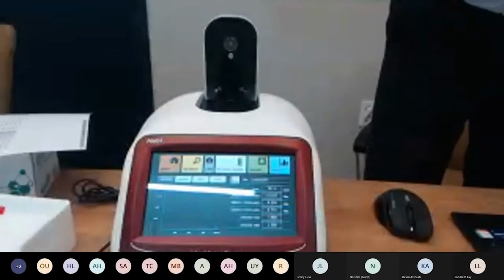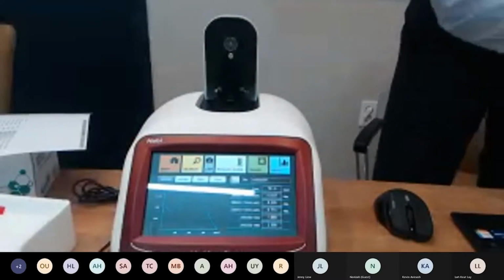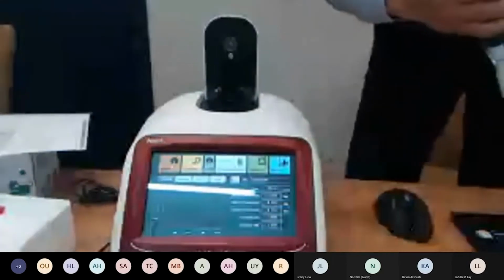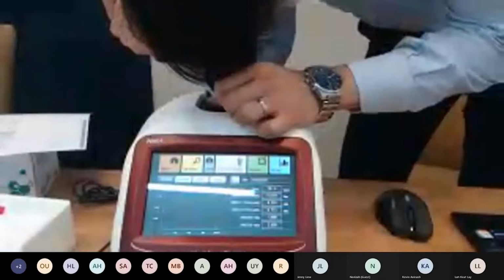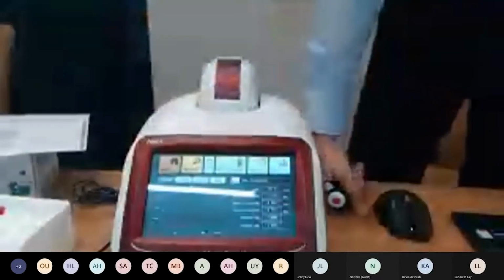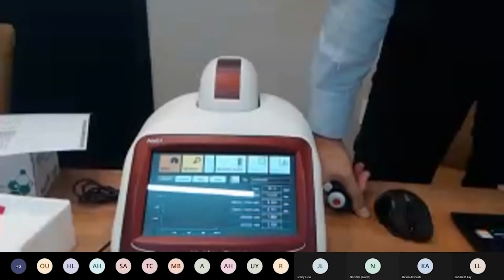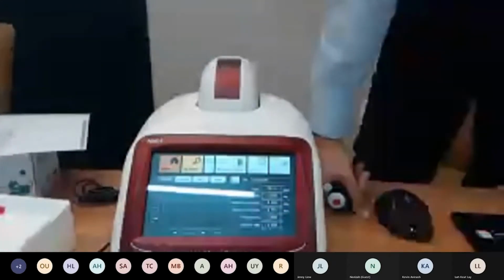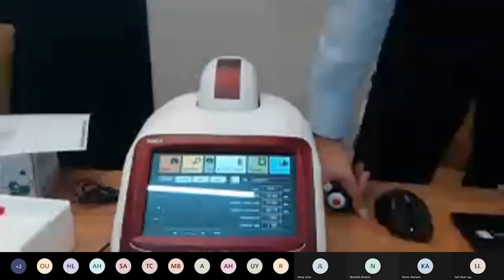And also show you the 1300, or what should be 1300, which is around 1350. Because this is a medium concentration, you'll be able to hear two measurement sounds, or three, depending on the concentration.